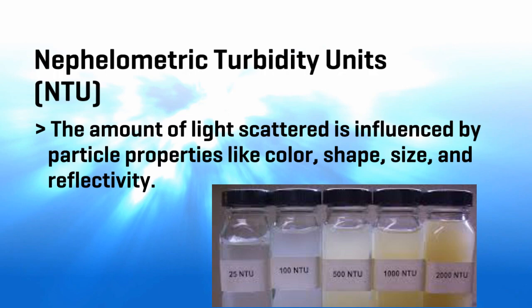Color can be a big concern if you're testing natural water. Certainly, you can get some color in those samples, and that will affect the ability for a beam of light to shine through that sample and be registered on the other side. It'll increase your turbidity levels when, in fact, it may not be as turbid, simply being caused by color.